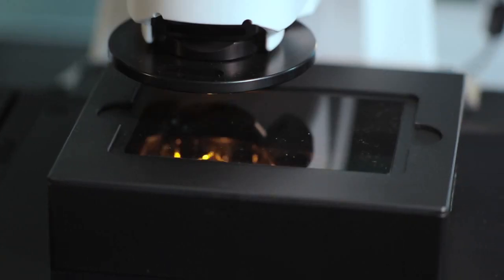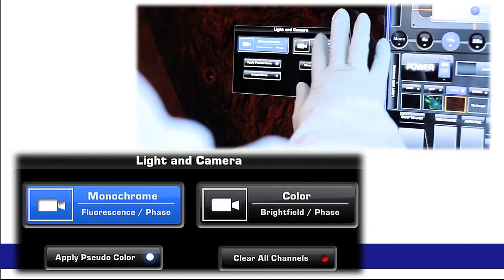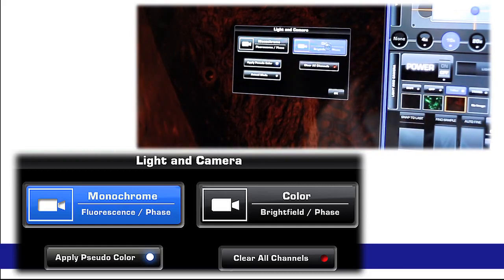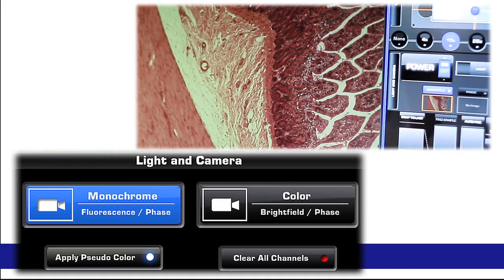Whether performing fluorescent or colorimetric assays, the EVOS FL Auto is equipped with monochrome and color cameras allowing the capture of high-resolution images in either format. Changing between cameras is as simple as touching the screen.